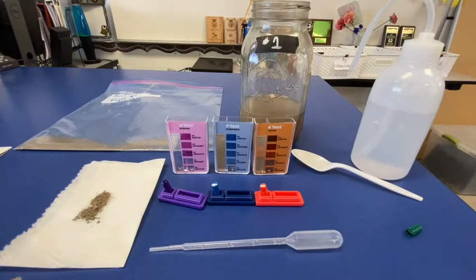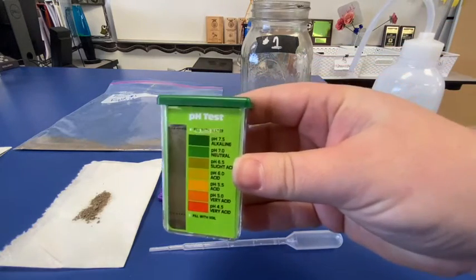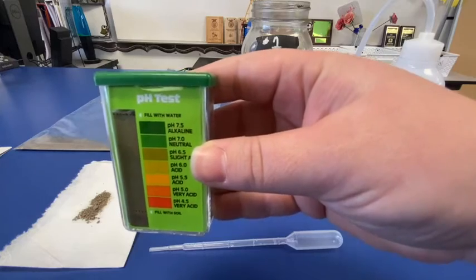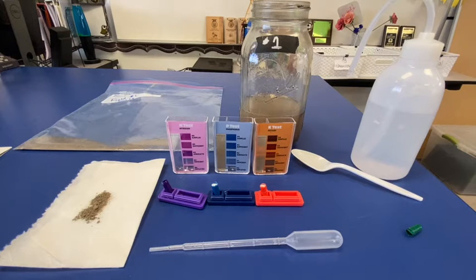And I'm going to shake this for one minute, making sure that it's fully mixed — that the soil is going to be dissolved and that the indicator we added is going to be all throughout that liquid. From this, we are going to be able to see what pH it is. We only need to let this sit for one minute, and we'll start to see that it will change colors. I'll keep shaking it a little bit longer to make sure that it really shows us the true pH of this soil.